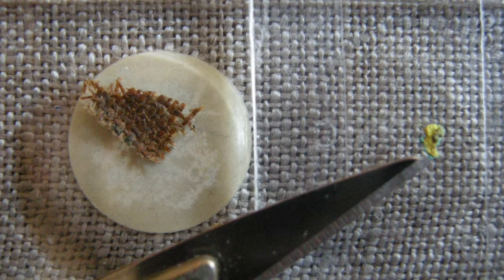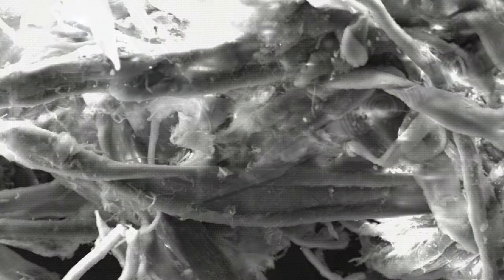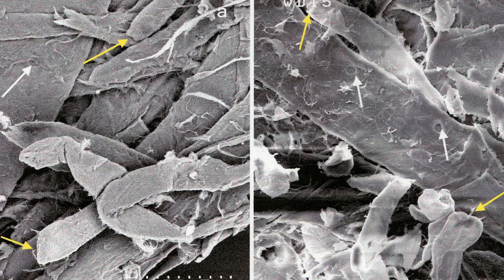Now, to examine the canvas, the back of the artwork where the canvas is visible is scanned under a microscope. The twist of the flax, hemp or cotton yarn and the weave of threads are inspected for any contamination with plastic fibres. The plastic fibres might originate, for example, in synthetic binders, which serve to bond flax fibre bundles, or they can arise as a result of pollution. Such contamination is common after 1950 because of factors relating to the weaving process and in particular with regard to the supply of flax, hemp and cotton fibres from the power loom. Under the microscope, a plastic fibre can be clearly observed, its length, thickness and the profile of its cross-section.